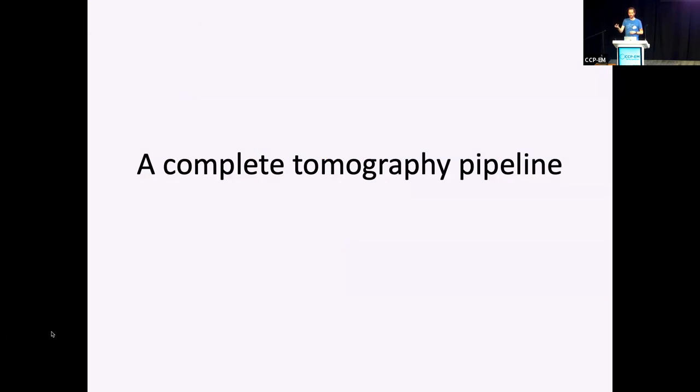Okay. Now the last bit is a new tomography pipeline in Relion 5. When I wrote the email about the beta release back in autumn, I said it's not ready yet, don't use it. Some of you, I know, have been naughty and have been using it, and I'm grateful to those of you who have provided feedback, which has helped to make it better. But as we just announced this week, that has now been finished, thanks to a lot of work from the people I already mentioned. And I'll briefly walk through it.